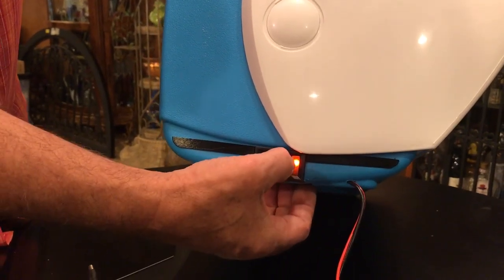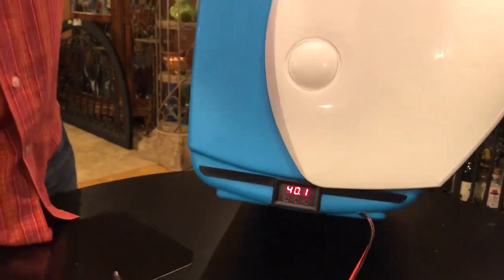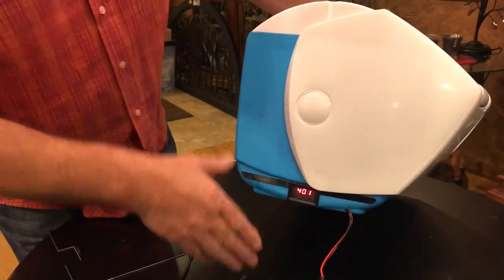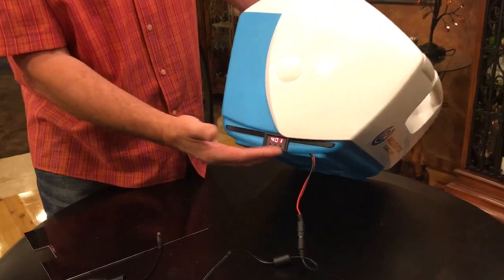And if that light's on, it's heating, and then that light goes off. There it goes, it just went to 40.1, and the heat went off. Okay. It'll climb a little bit, get up to about 40.2, and then it'll drop back down again, and the heat will come back on. So it's a thermostat. This is a thermostat that regulates.